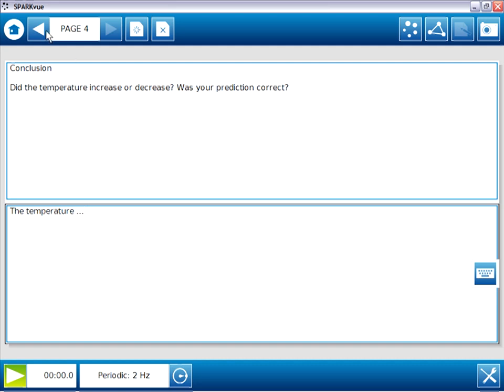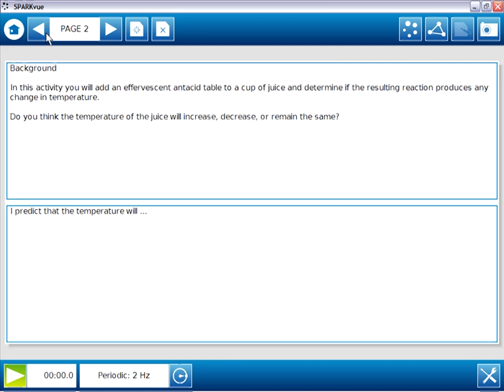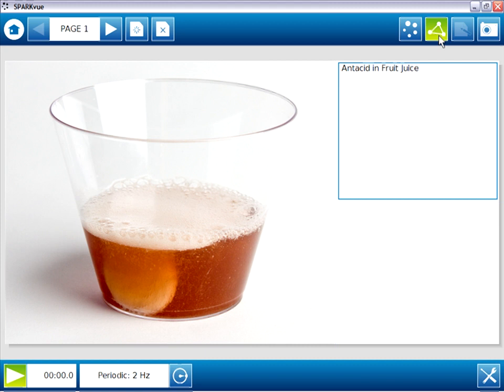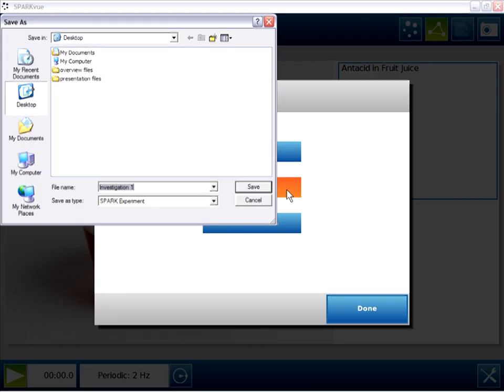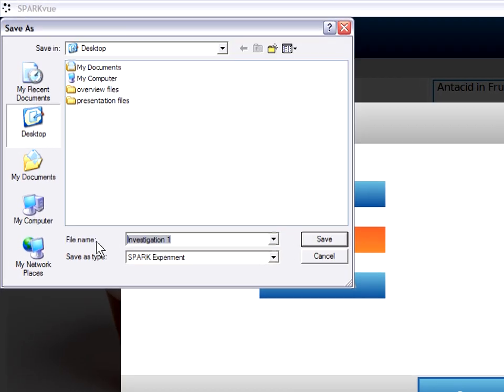Let me page back through, just visually scanning these pages to make sure they look okay, I didn't miss anything. And they look like they're okay. So what I'd like to do now is save this file as it currently is. So I'll go to the sharing button in the upper right, choose to save this file as, and I'll give it a descriptive name, and let me call it basic to remind myself that this is the lab I created using the basic authoring technique.